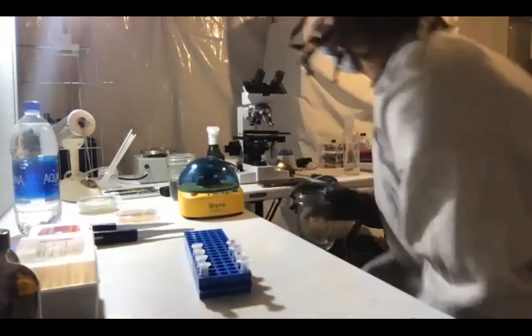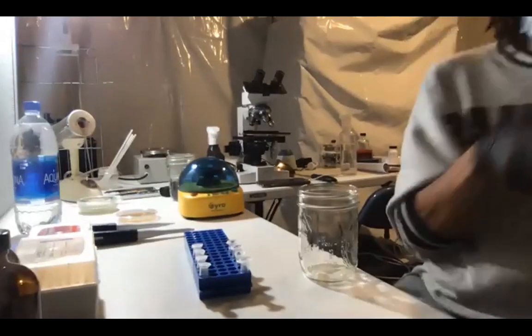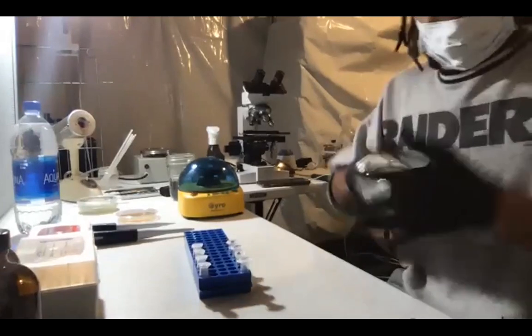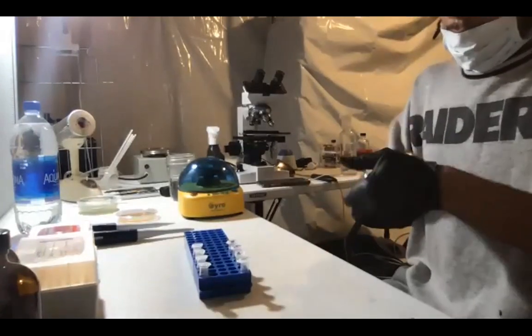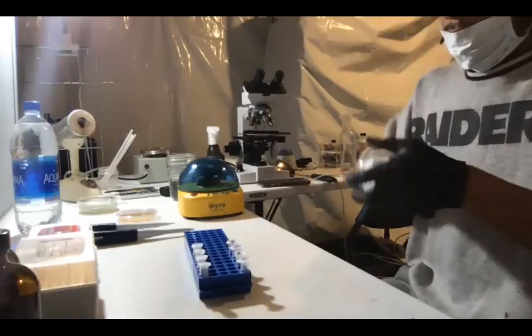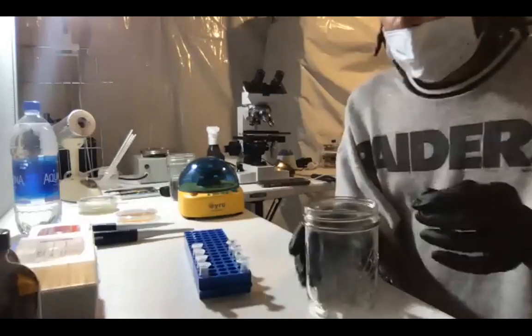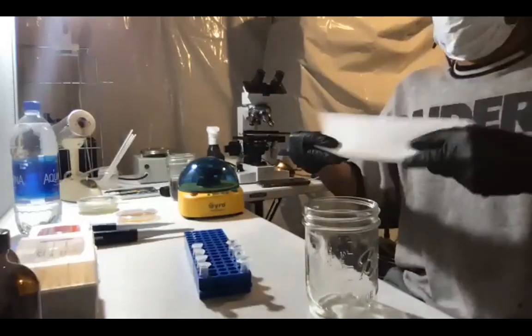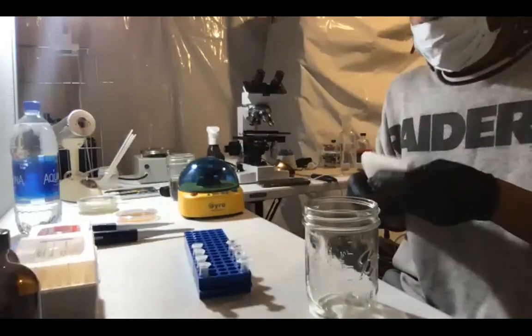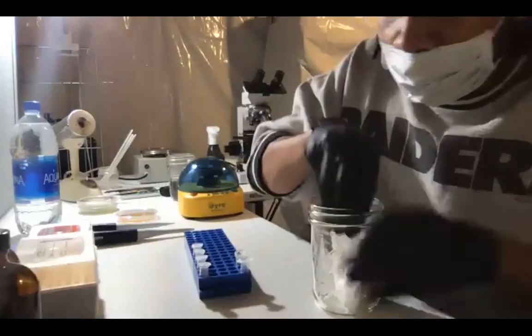All right, and I'm back. All right, so I just have a glass jar. This is definitely citizen science at its best. I just sprayed out this glass jar with isopropyl alcohol. I'm going to take this little piece of paper towel and stick it in there so the tubes stay upright.